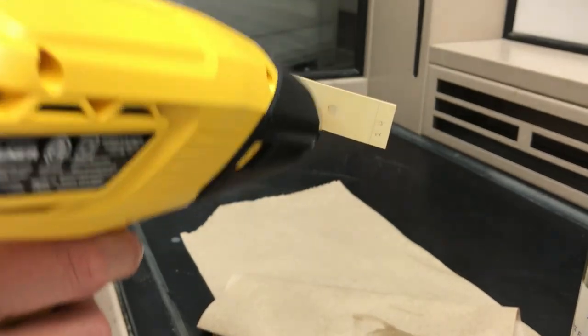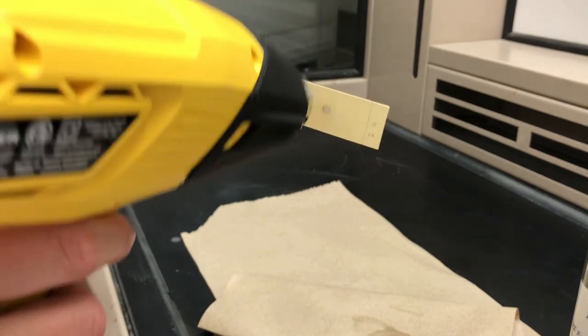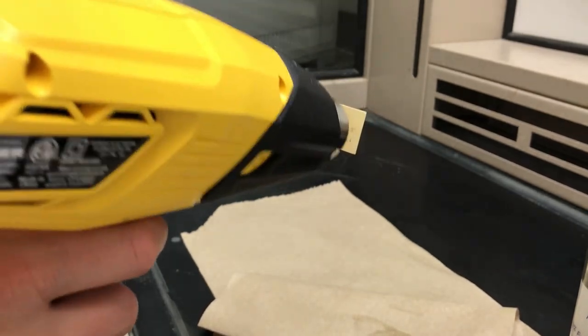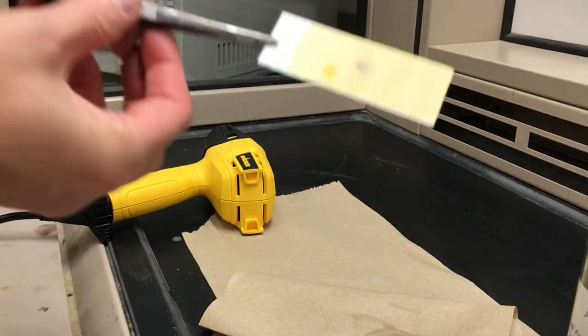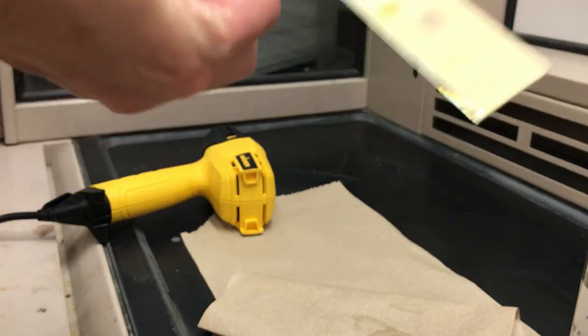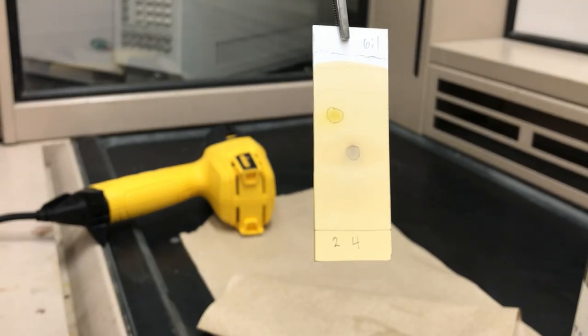What we end up getting here is I had two samples that were actually pure. One of them with the stain is showing a dark gray spot and the other one is showing a yellow spot. From the stain I was able to see where the molecules ended up after the TLC.